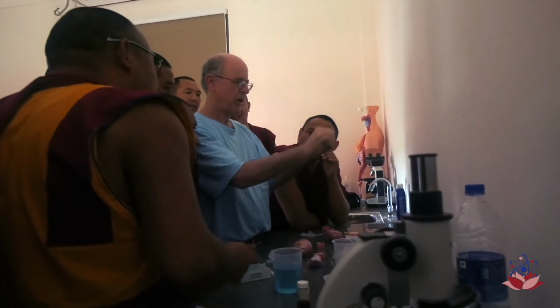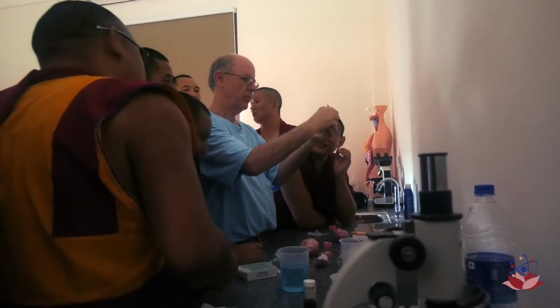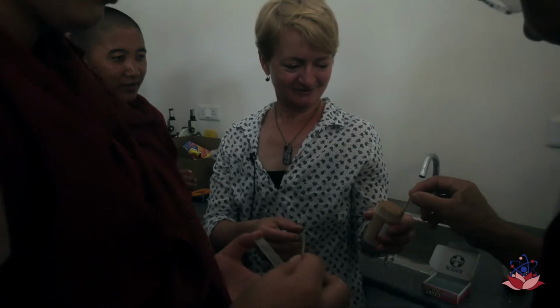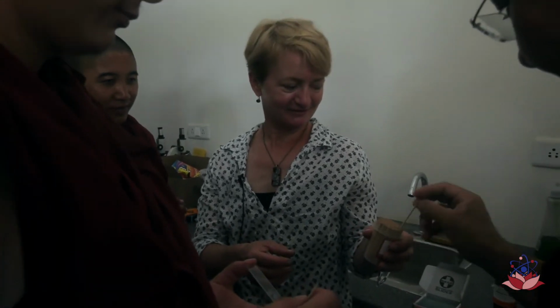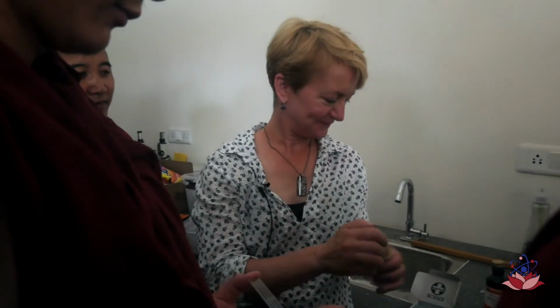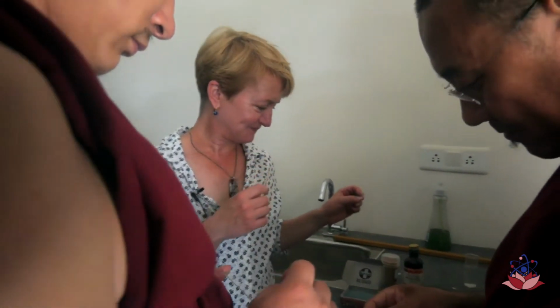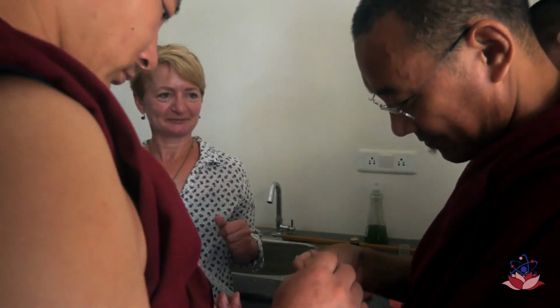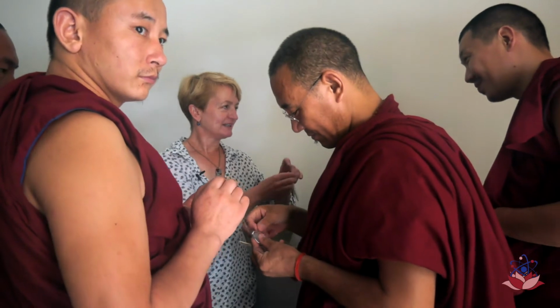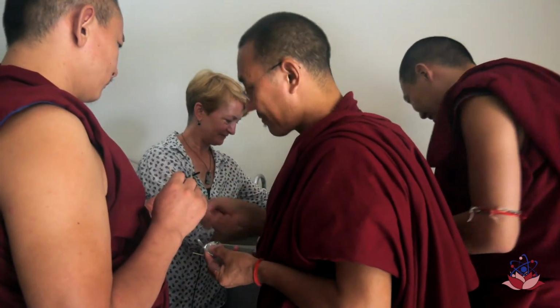This. And it helps to put a little drop of water on your slide first.